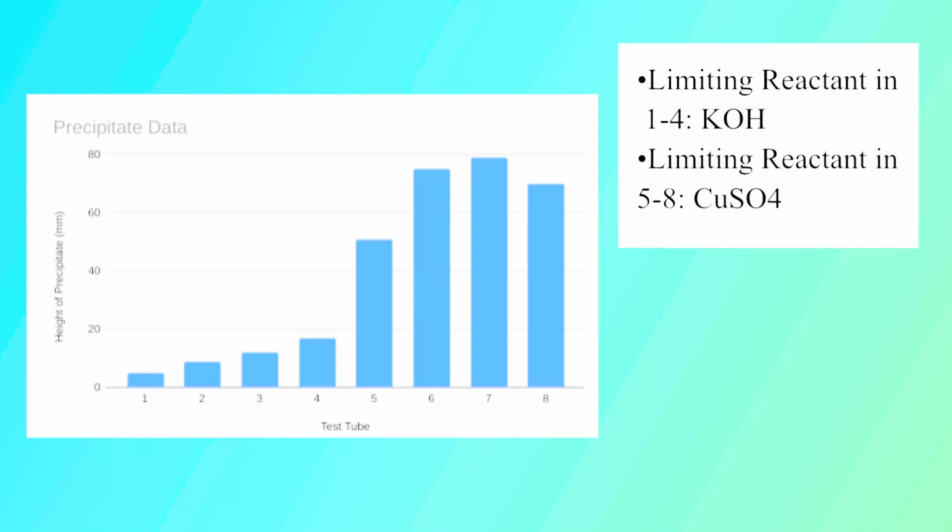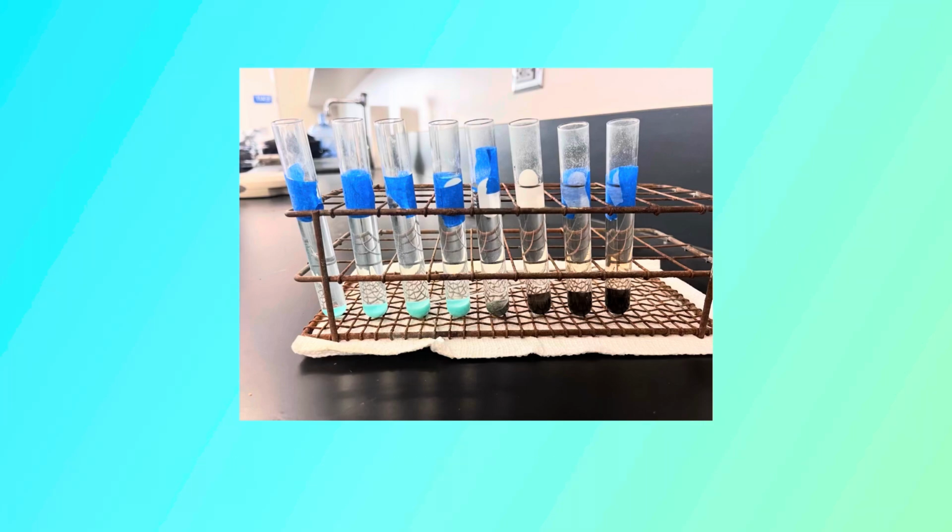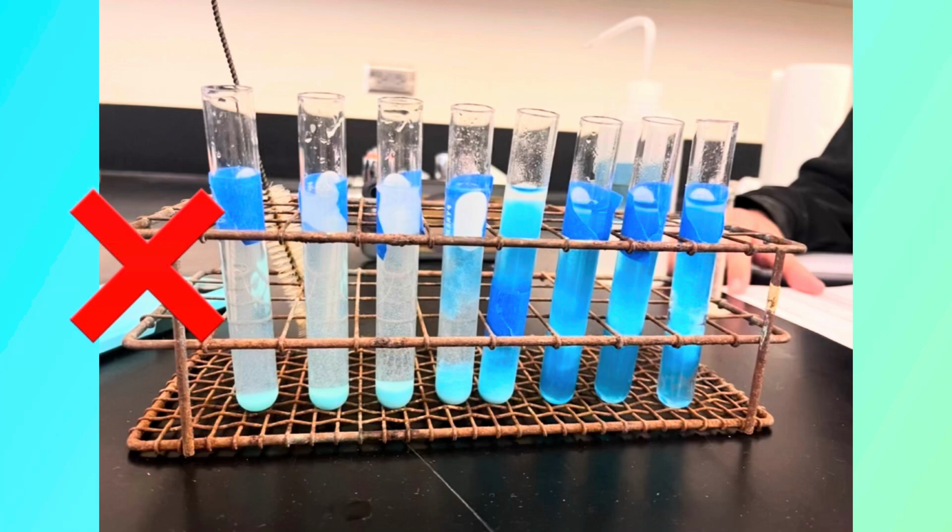Despite there being surplus potassium hydroxide to produce more precipitate or product, it cannot because the amount of copper(II) sulfate stays consistent, hence the lack of increasing precipitate height. The copper(II) sulfate is entirely consumed before more precipitate can be produced, ultimately resulting in a plateau in precipitate height. The height of our precipitate may have been slightly exaggerated, especially in test tubes 5 through 8, because it was not completely settled at the time of measurement.